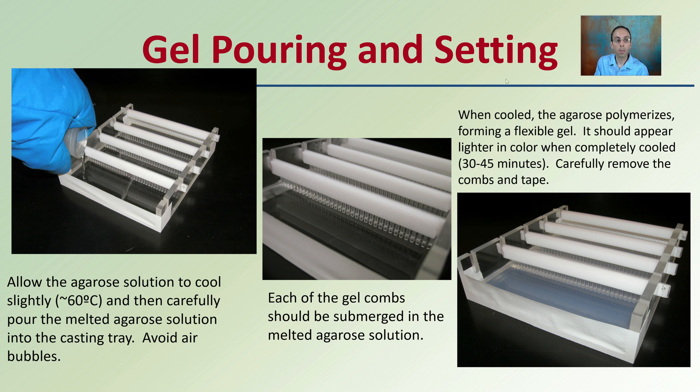Once boiled, use insulated mitts because you'll be pouring very hot liquid. Let the agarose solution cool slightly but not too much — otherwise it will solidify in the flask. Cool it to about 60 degrees Celsius, then carefully pour the melted agarose into the casting tray to avoid air bubbles, ensuring each gel comb is submerged. When cooled, the agarose polymerizes, forming a flexible gel. It should appear lighter in color when completely cooled, which takes about 30 to 45 minutes. Then carefully remove the tape on the sides and the combs — you have a prepared gel.